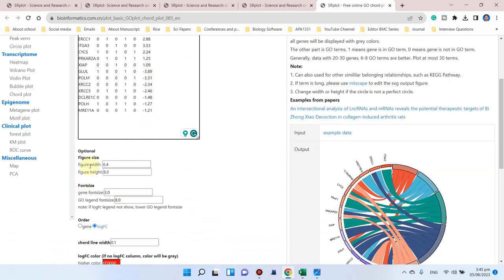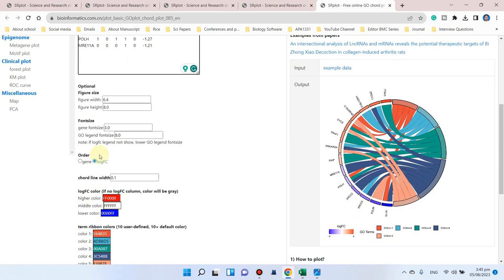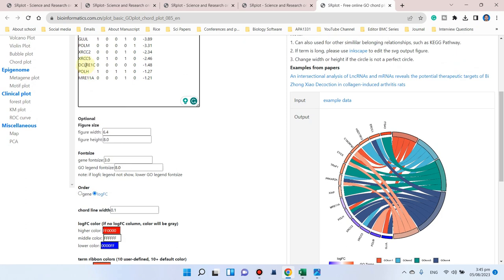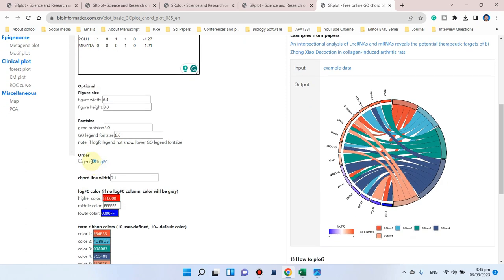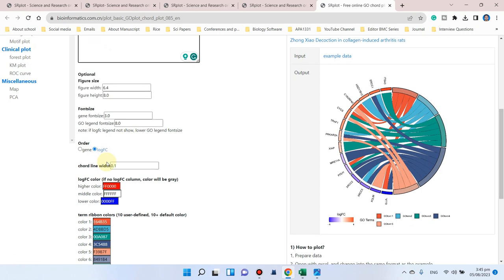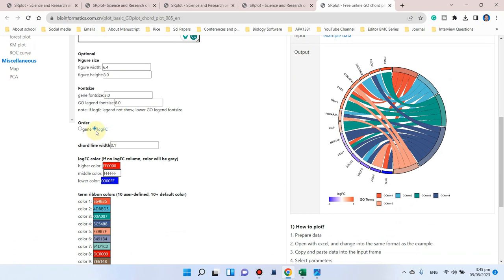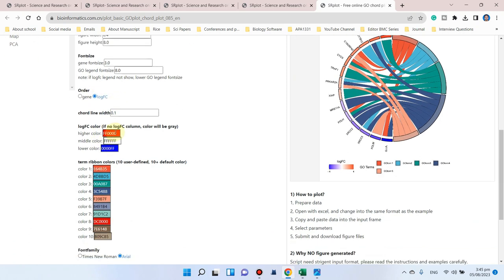Here you can design and optimize your figure size. Here you can choose which order you want - you want to order on the basis of genes or you want to order on the basis of log FC. I would like to use log FC.